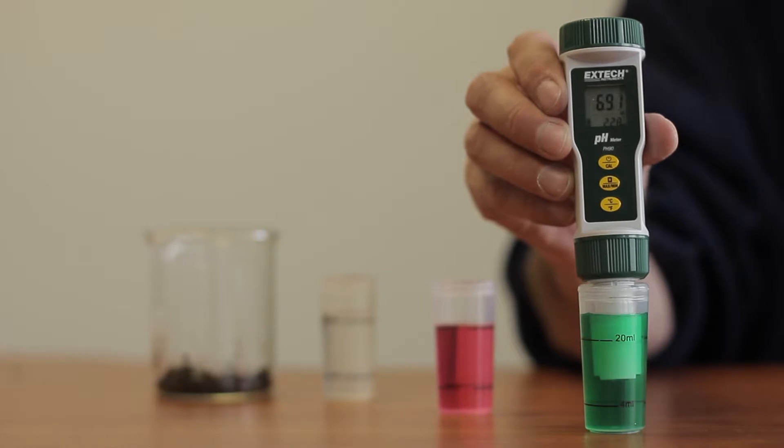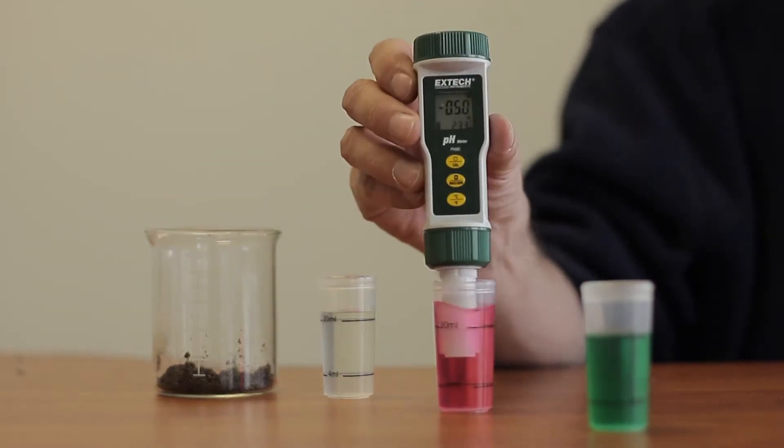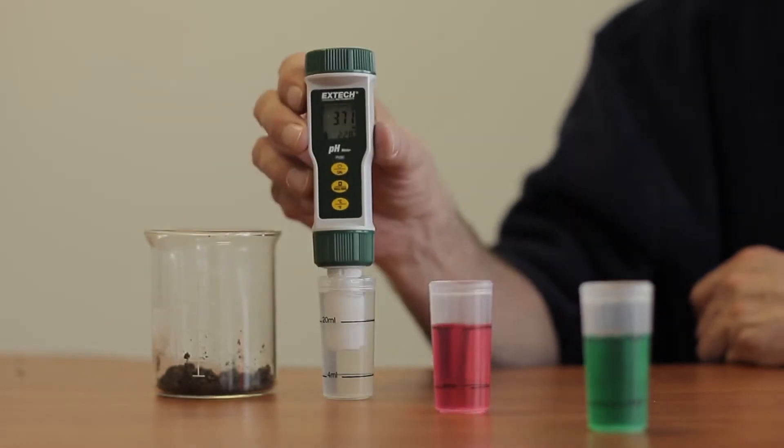Before you begin the soil test, you'll need to calibrate your meter. Here we're calibrating the meter to known pH values. This will establish the meter's range. It is important to calibrate every time you use a pH meter, or it will not provide a reliable measurement.